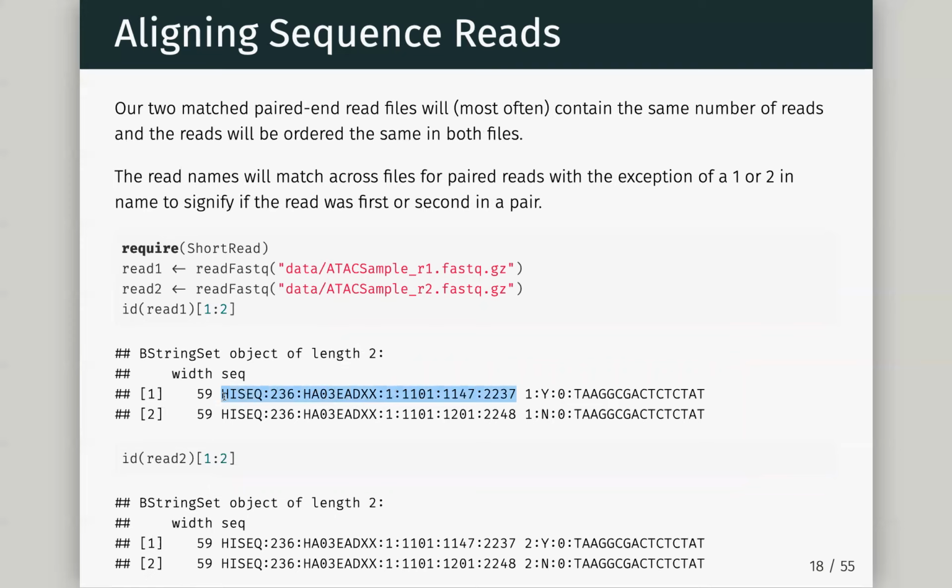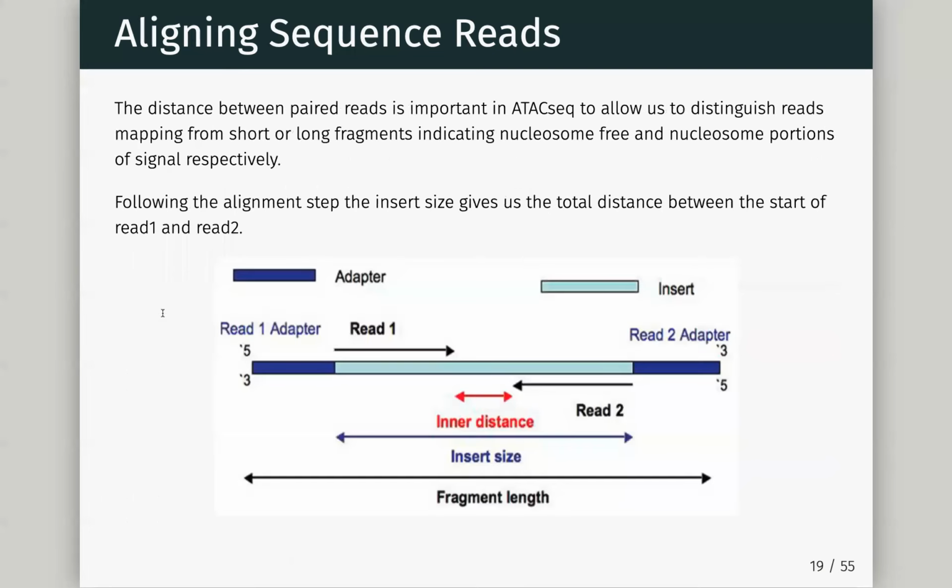This read name is the same across the two, but the sequence will be different. It may overlap in the middle, and then you'll be able to tell this. This bit here is the ID. If we did seek read 1, we would get the sequence for it. And actually, we wrote some software which, when they overlap, allows you to make one long super read, and that's useful.